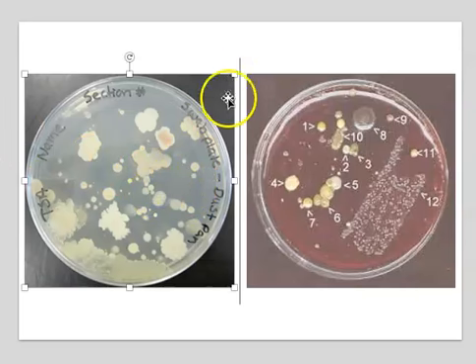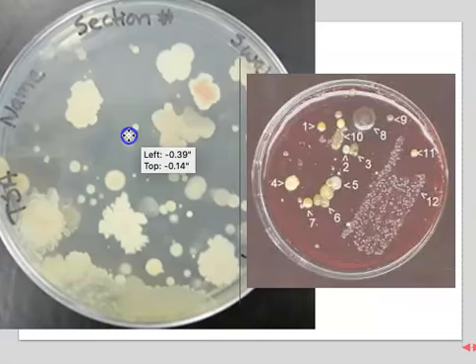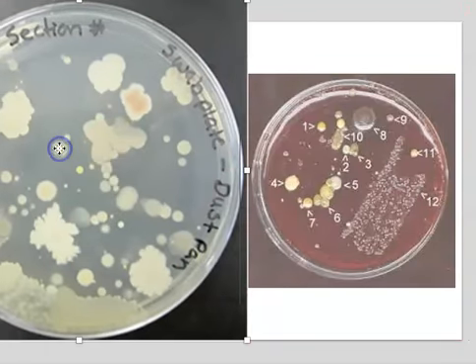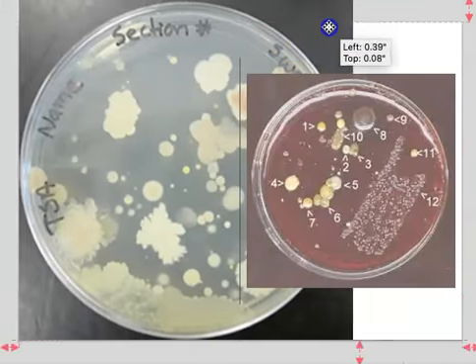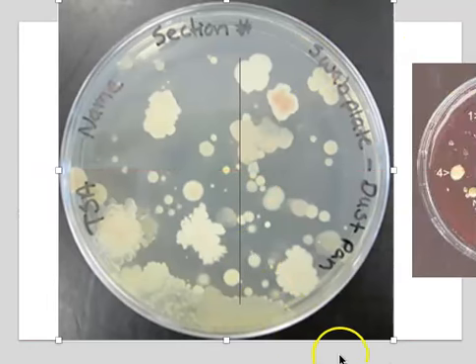If you take a look at this plate right here, this is also an environmental sample. Here, I'm going to move this one out of the way just for a second. A couple things to notice. Number one, what a well-labeled agar plate. You can see that there's lots of information written on this plate.